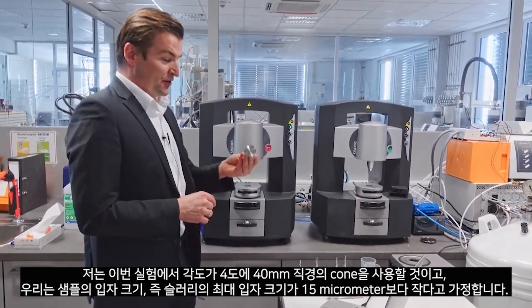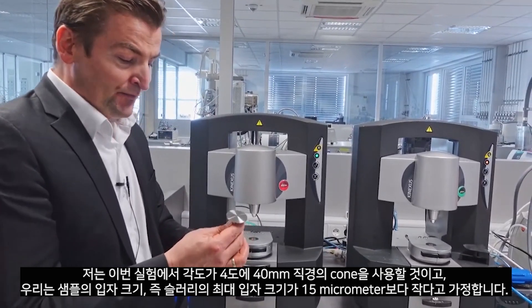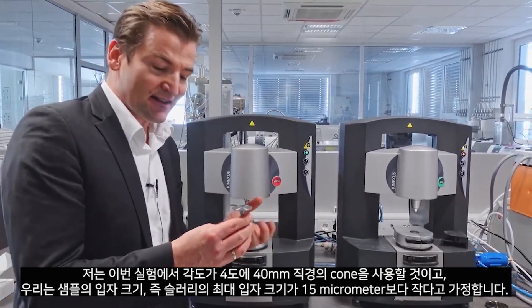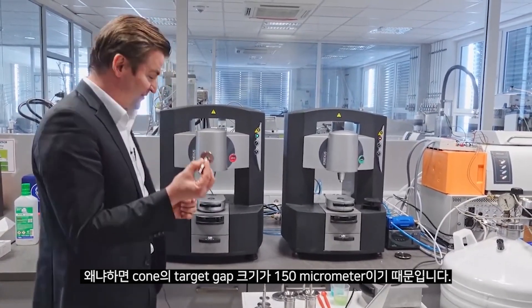I will use for this demo a cone with 4 degree cone angle and 40 millimeter diameter. We assume that our maximum particle size in the slurry is less than 15 microns, because our target gap for the cone is 150 micrometers.